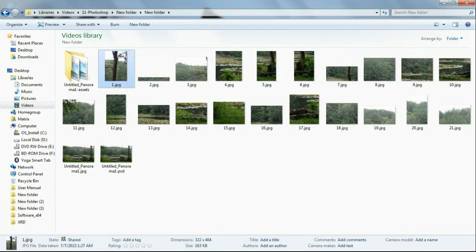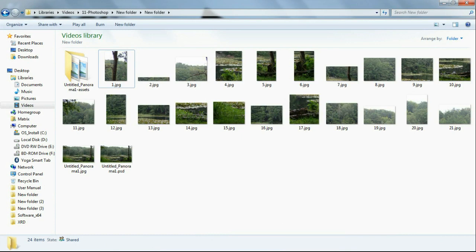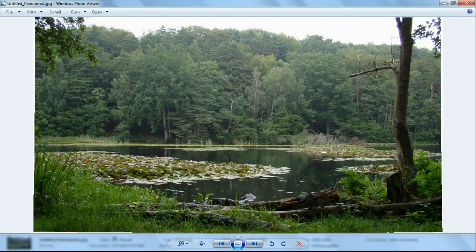There should be no scale or repetitious writing on microscopic photos, because in that case, the images are gathered around the same writing or scale. You can cut or erase them to remove the scales. By selecting and then removing the words or scales, the image surface of the sample remains. The best thing is, if the scale or words are in the photos, select it and click Delete from the keyboard, but if it is outside the photo, cut it.